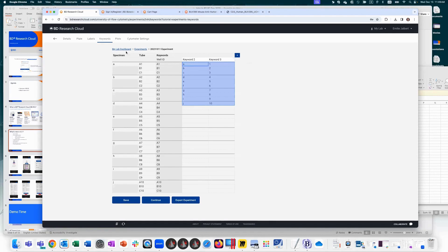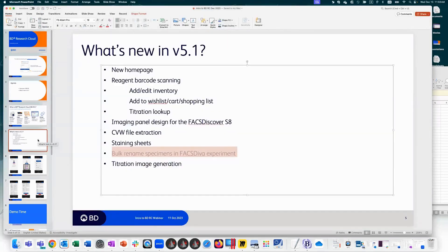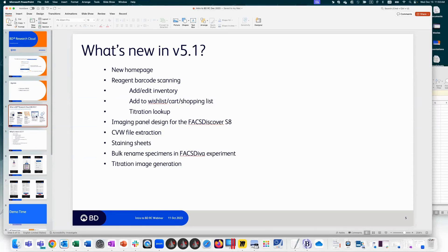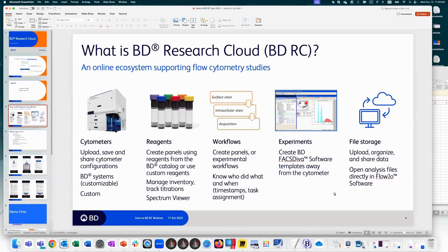The specimen bulk rename is a new feature of this release. In a nutshell, those are the upgrades for 5.1. I'm happy to go into more detail on any of these or explore existing BDRC functionality. Thank you very much for joining — I hope you give BD Research Cloud a shot and let us know what you think.